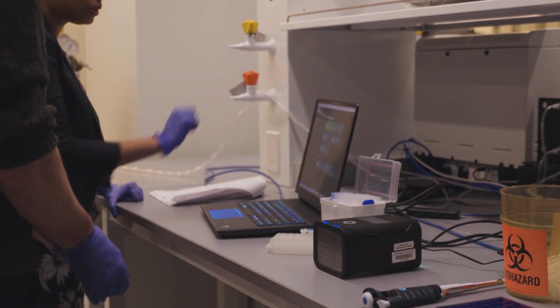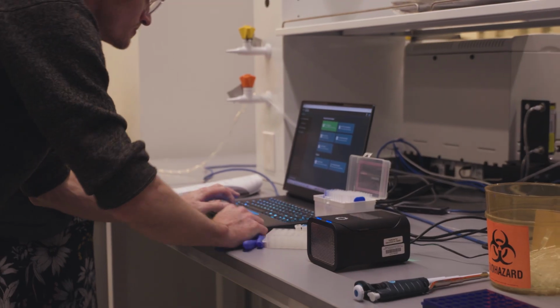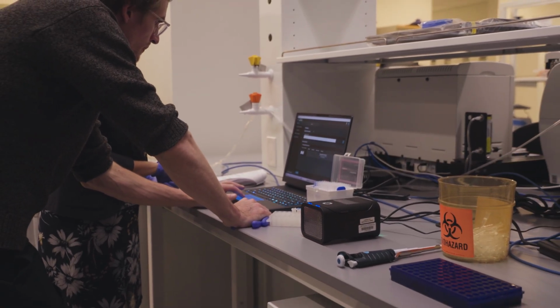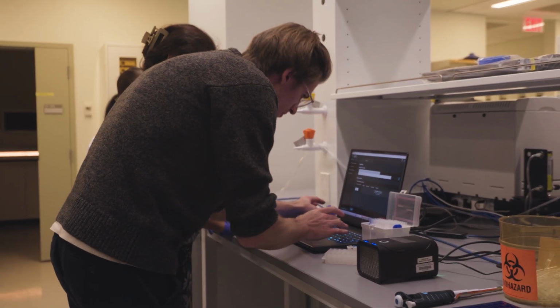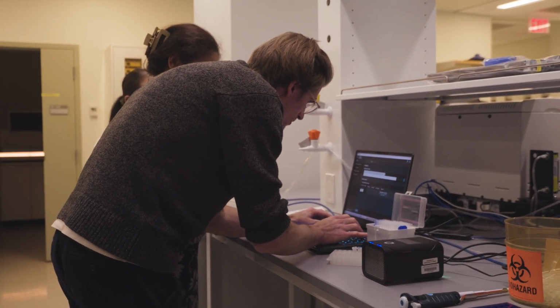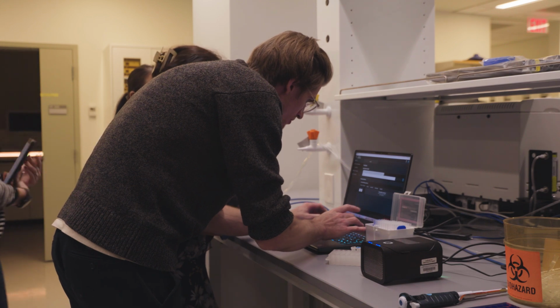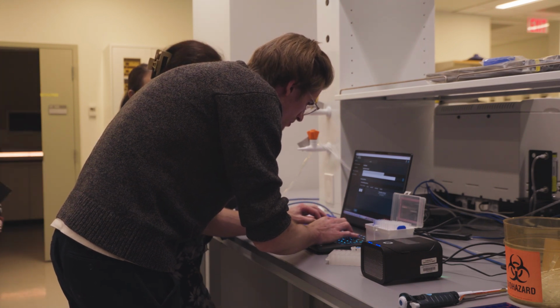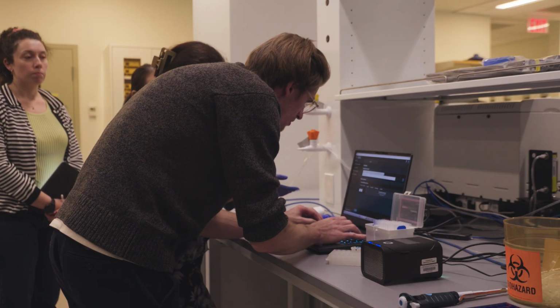I can show you. Let's go to start sequencing. We can do some cfDNA pilot, however you want to name it. So 19th. You can do ANT because this is a part of the training.